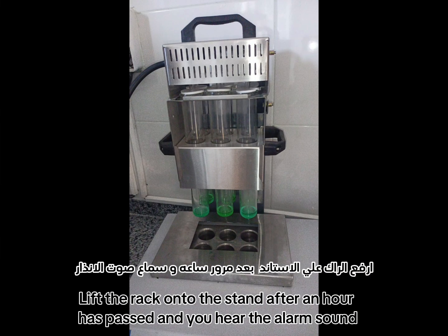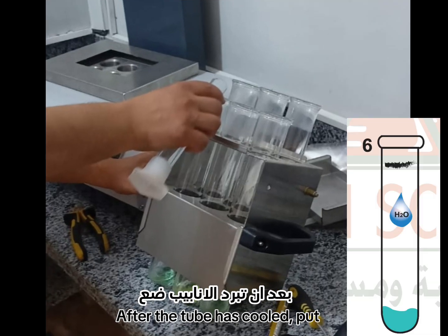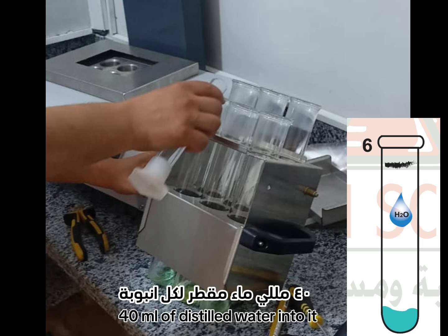Lift the rack onto the stand after one hour has passed and you hear the alarm sound. After the tube has cooled, put 40 milliliters of distilled water into it.